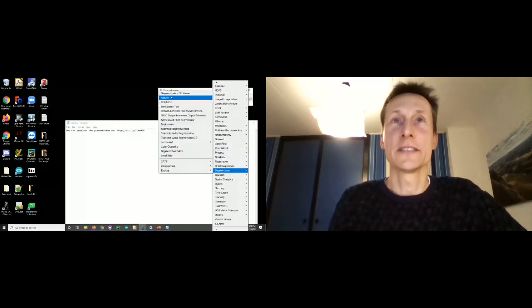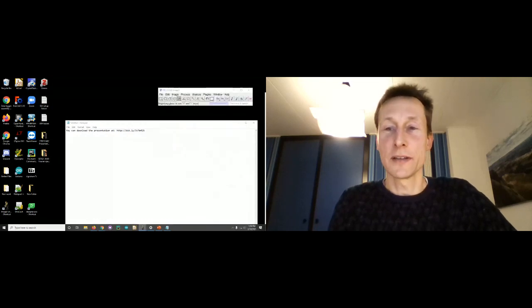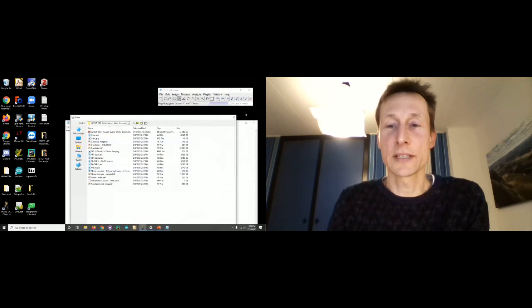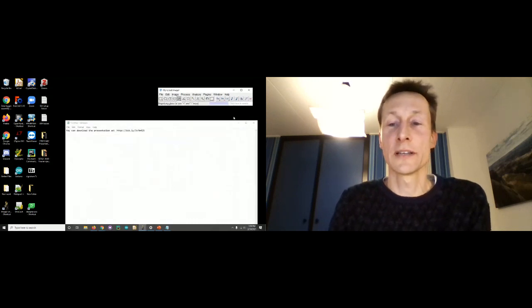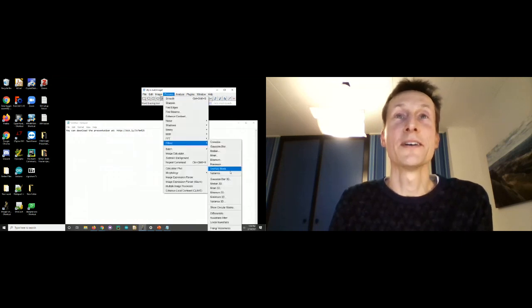I think nowadays it's under... You can hear me, right? Yep. Okay, so now in the new version, I think since a few months or weeks, it's under Process, Filters, and then just Top Hat. If you have it already. Oh yeah, I guess I haven't updated.